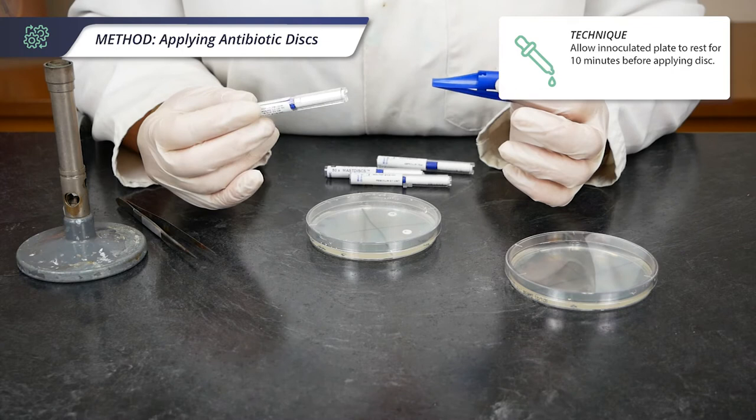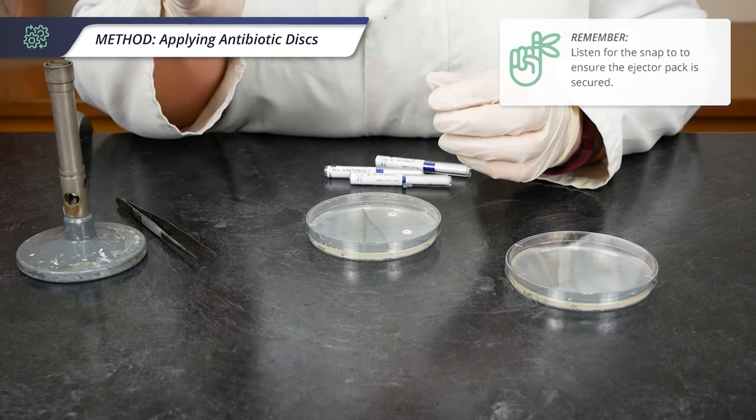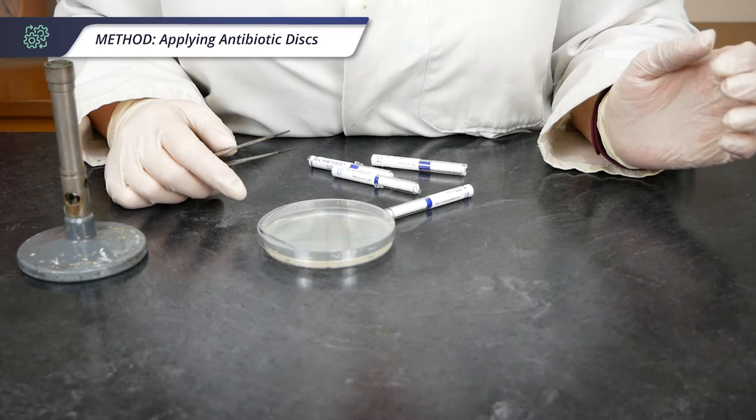There are two methods to apply your antibiotic discs. First I'll demonstrate the use of the ejector pack. Pop your tube of discs into the pack and listen to it snap. I've got chloramphenicol here, so I'm going to put it into the segment marked C — just click that through.